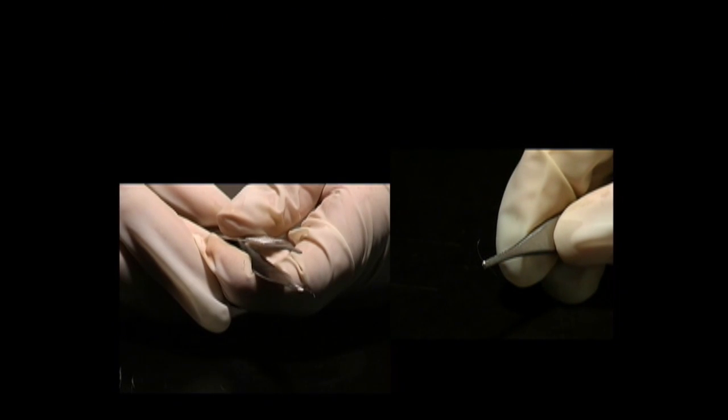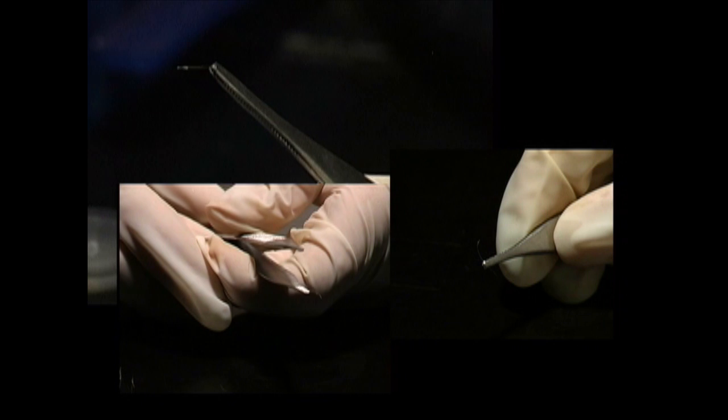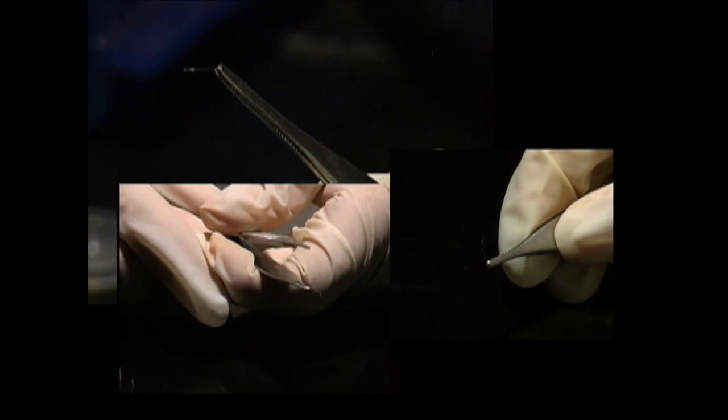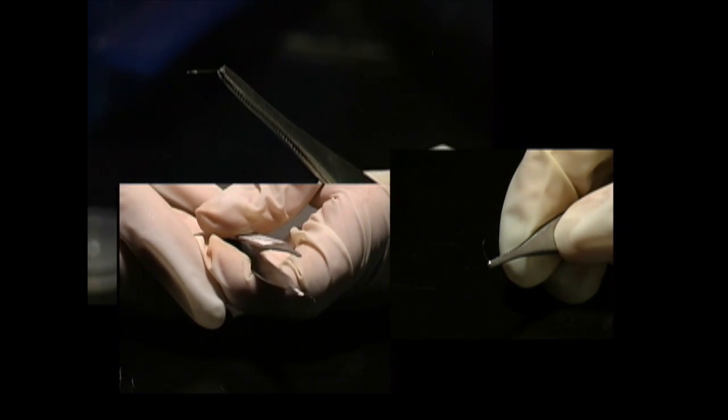One simple way of obtaining cells is from eyebrow hairs. Pluck three or four that contain a sheath, a barrel-like structure that surrounds the base of the hair. Sheaths are often white.